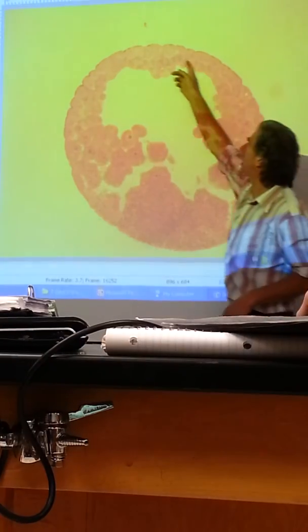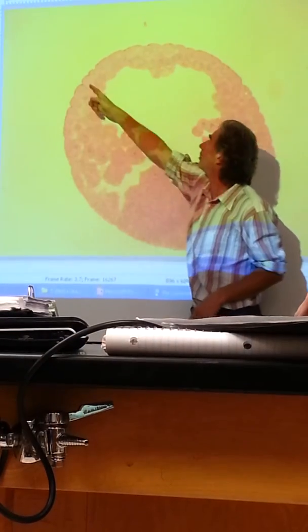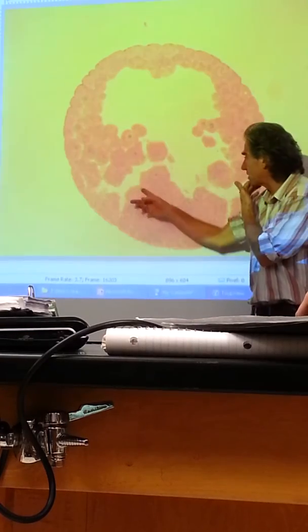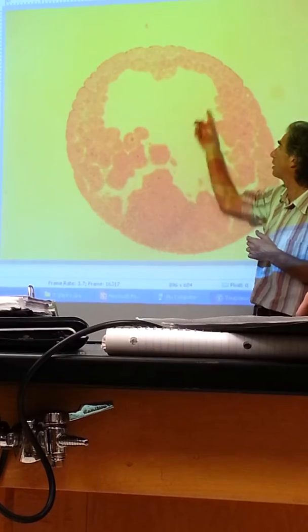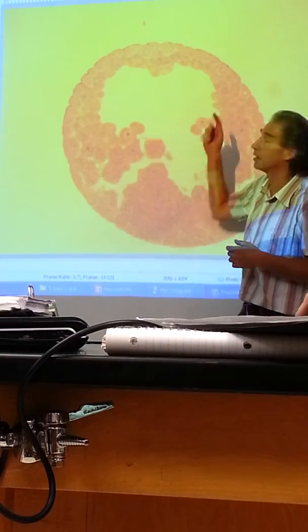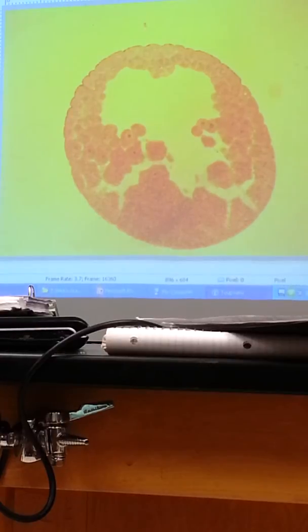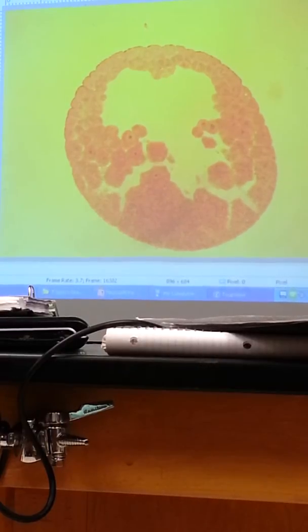Here are small blastomeres along the animal pole. I am still seeing a little bit of that pigment up along the animal pole. Big cells with lots of yolk down here. The blastocoel right here. There's not a whole lot, and that's why I say 15 seconds. Any takers? We're done. Go to the gastrula.